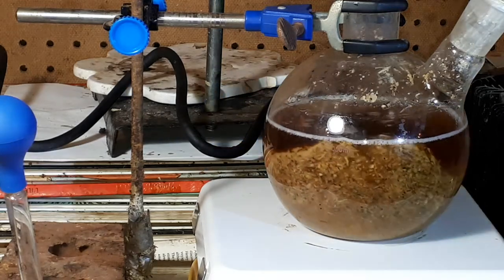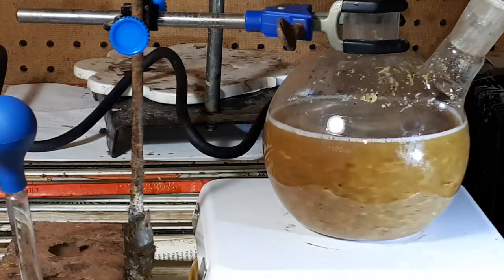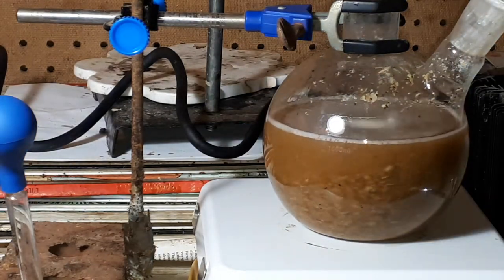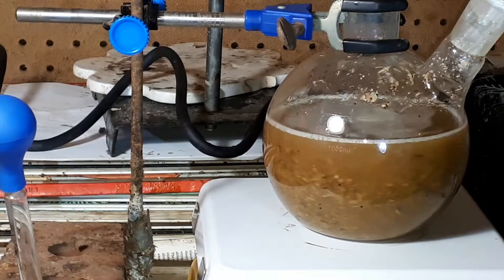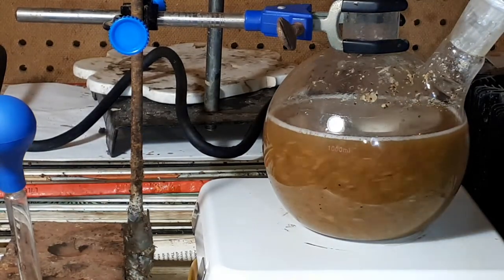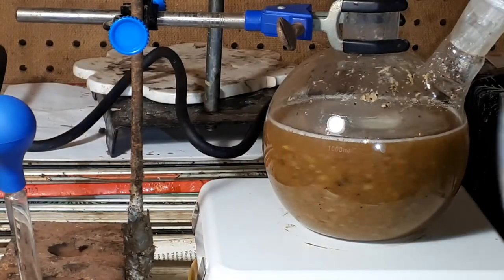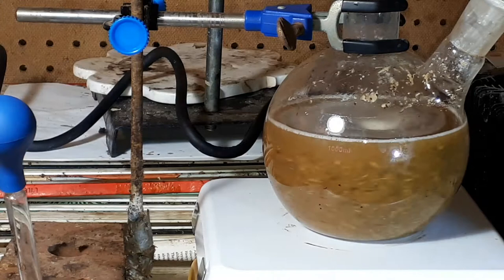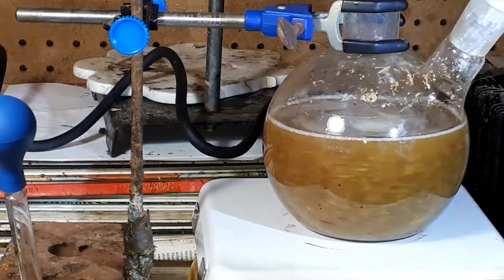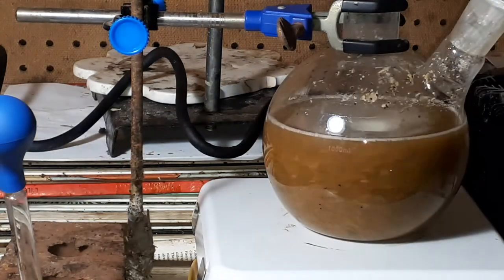It will stir for a bit, for a few minutes, and then it will stop stirring because it is too much for it to handle. There is nothing wrong with the hot plate or the stir bar — it is just too much for it to stir together. I have used these graduated flasks to measure out 250 milliliters times two, and another one to measure up to 750 milliliters. So this is about 750 milliliters of water with about 56 grams of extract.